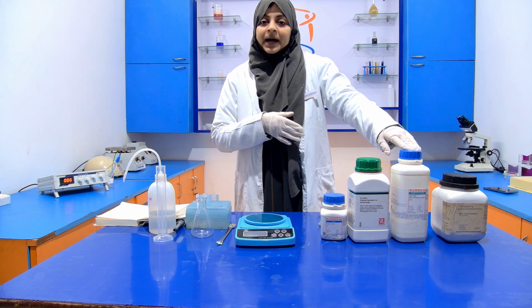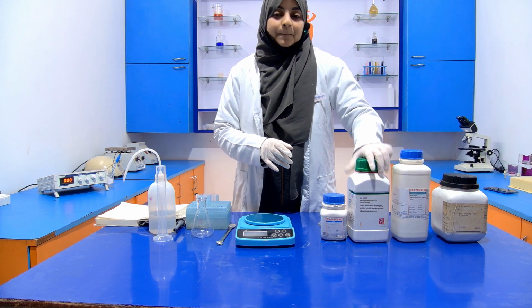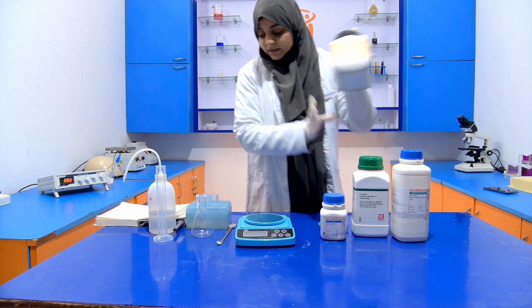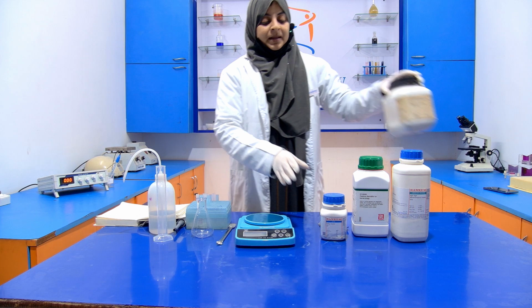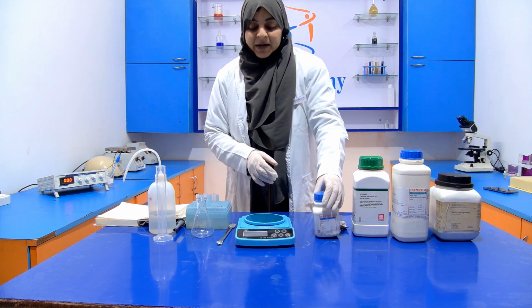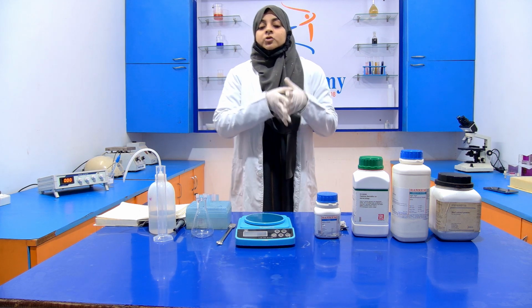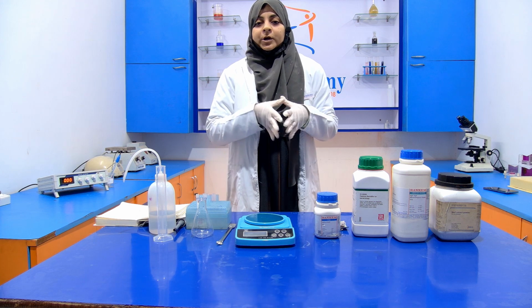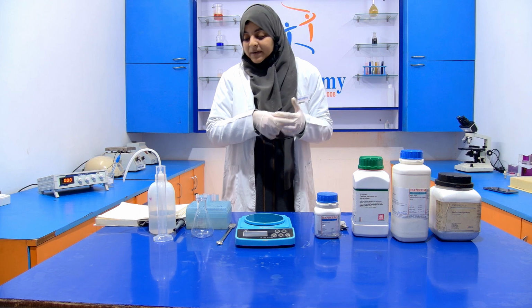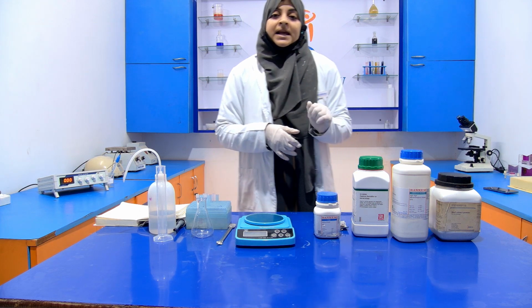We require agar around 15 gram, peptone 5 gram, beef extract 3 gram, and sodium chloride 5 gram. But today we are going to prepare it for 100 ml. So according to it, we are going to adjust the weight. But before preparing that media, we have to know what is the role of all of these chemicals.